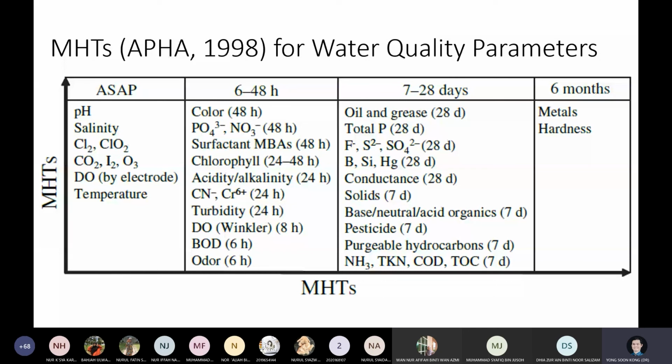Dr. Nadia also is teaching wastewater. If you happen to go to wastewater lah, you can ask either one of them to show you the picture or the video of YSI. YSI probe is a device in a briefcase. It's like a detector, like a portable pH meter. It's a portable meter, not pH only.